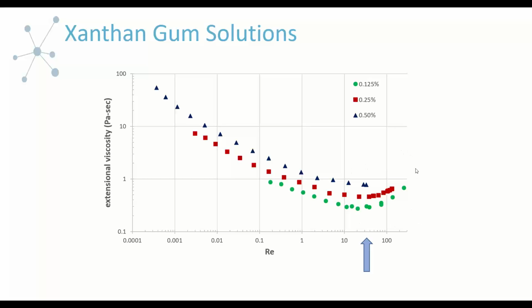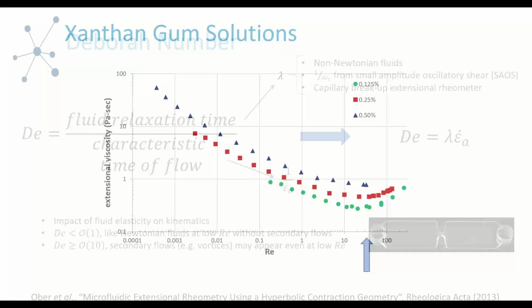So based on the Reynolds number calculation that we've done, and this visual artifact of apparent thickening, our best educated guess is that we are seeing secondary flows due to this inertially driven hydrodynamic instability. Okay.